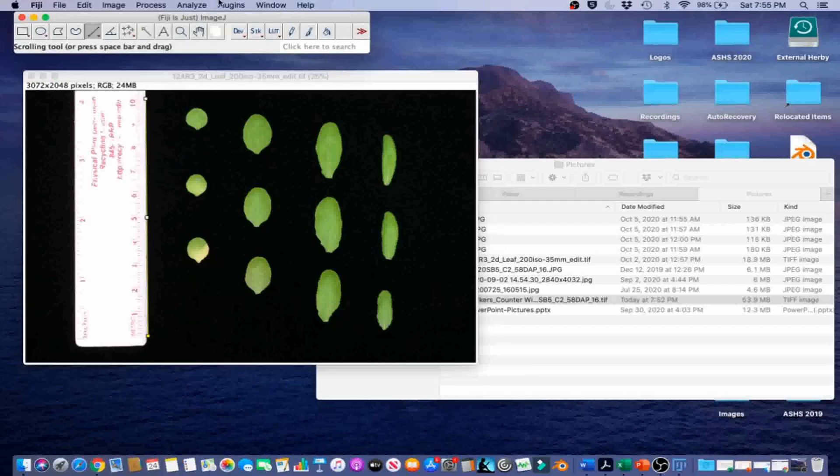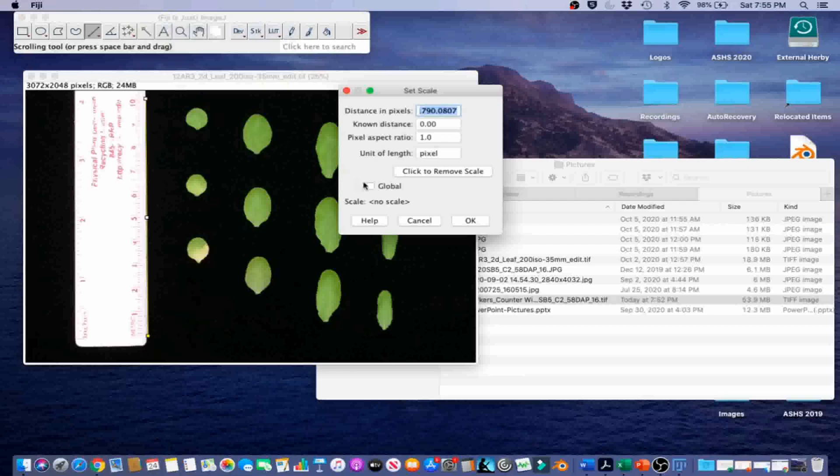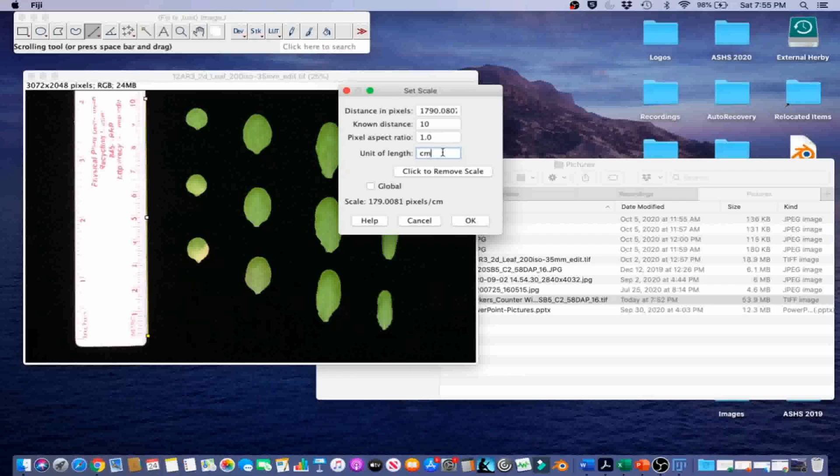I am going to put it up to the 10 mark in this case. Next, we are going to go to Analyze, Set Scale. We are going to set the distance to the line. We are going to fill in 10 for known distance and centimeter for unit of length. We are going to keep global unchecked. When the global option is checked, the same image calibration will be applied to images that will be imported subsequently.